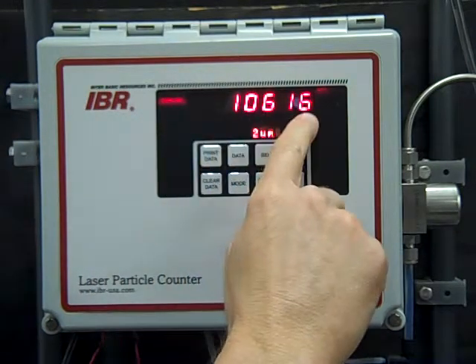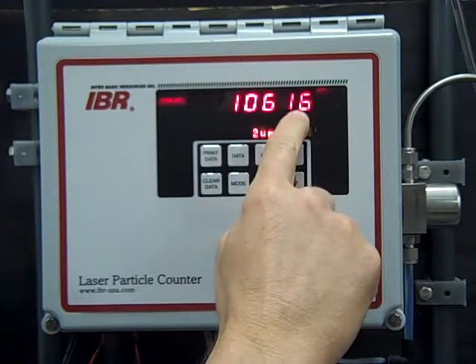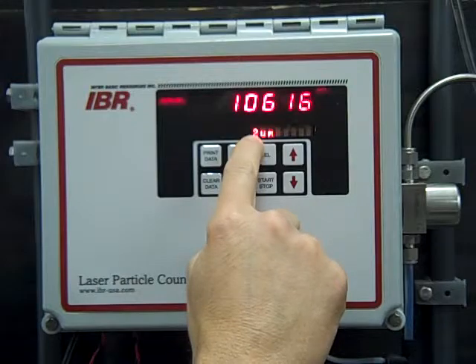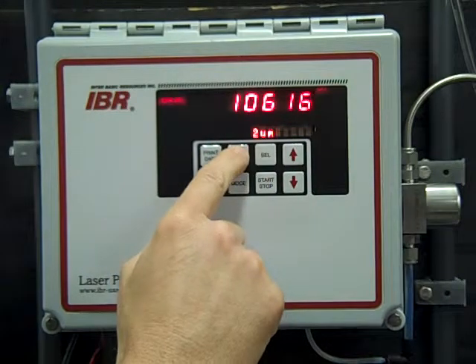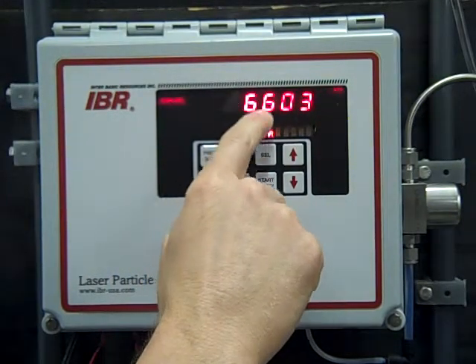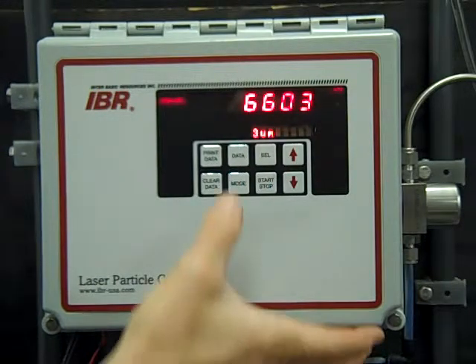Now, what this number means is there is 10,616 particles greater than 2 micron that have passed through the sensor in that 10-second time period. Moving over to the 3 micron, this means there is 6,603 particles have passed through the sensor in that 10-second time period.